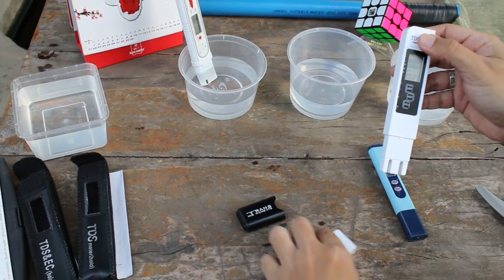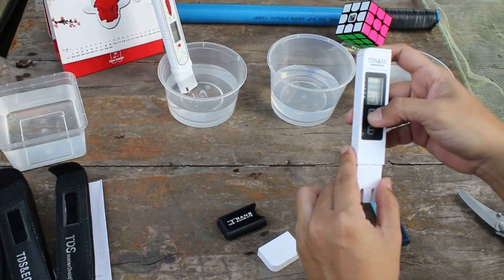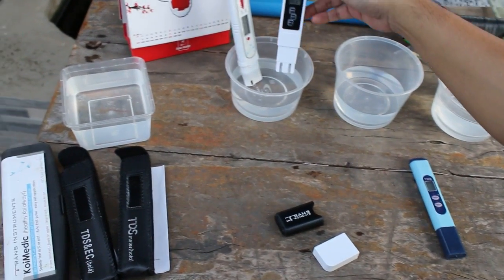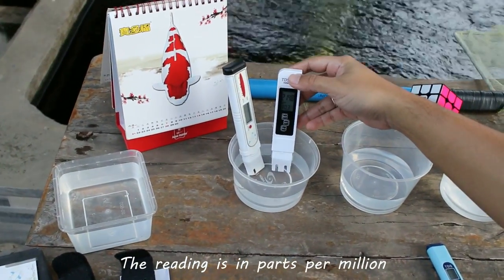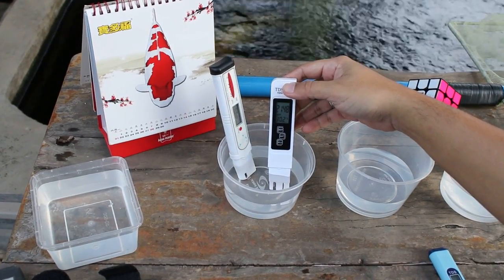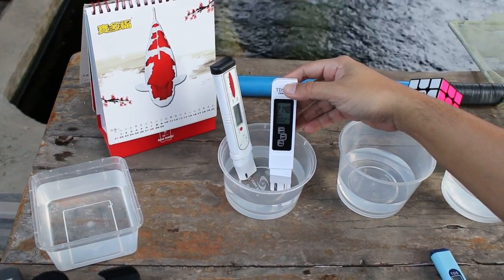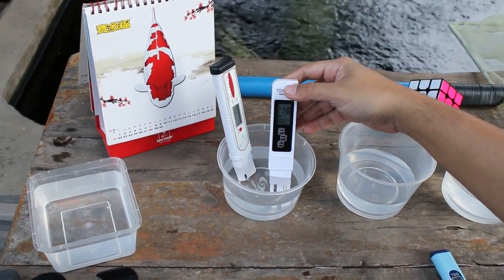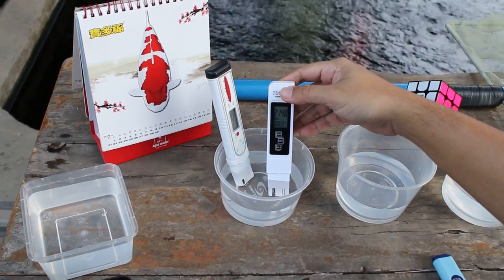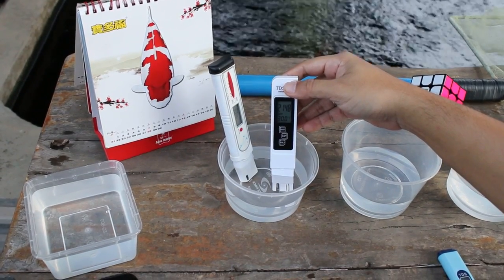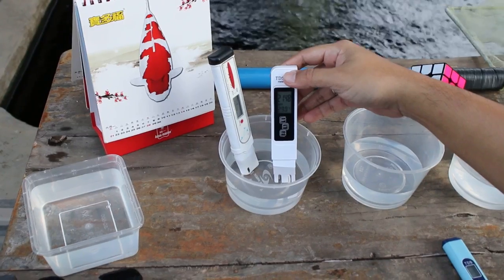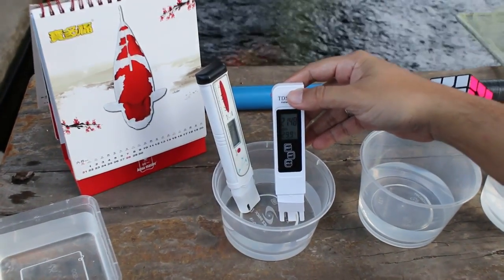On our first unit online, let's try it out. What reading is it going to give us? The reading is in parts per million, it's 2,146. So don't worry about that, we can convert that to parts per thousand simply by dividing the reading by 1,000. So 2,146 divided by 1,000, that's a reading of 2.14 parts per thousand.